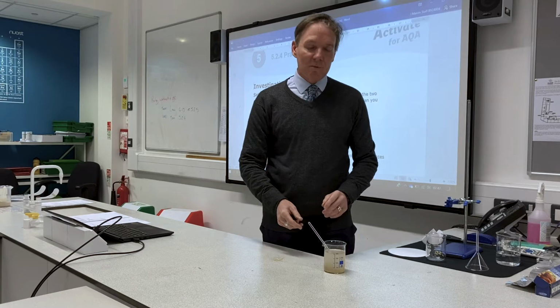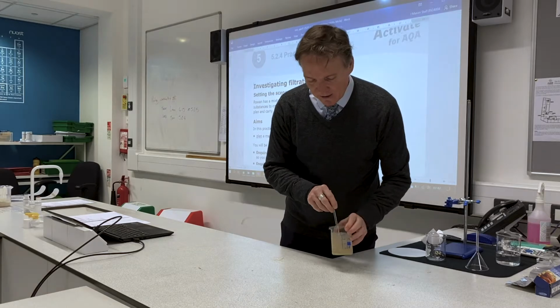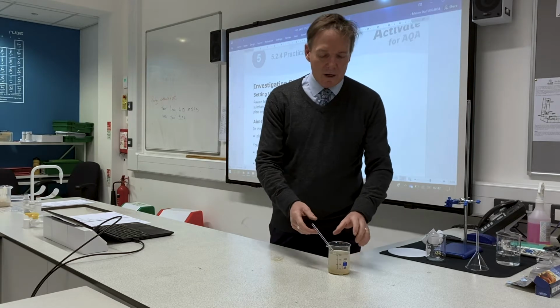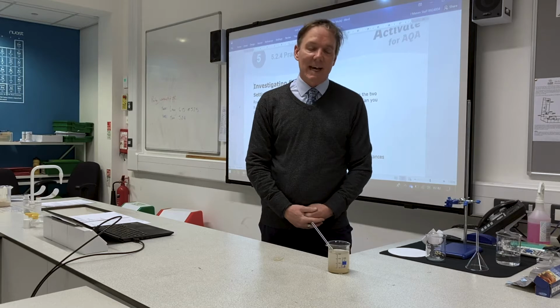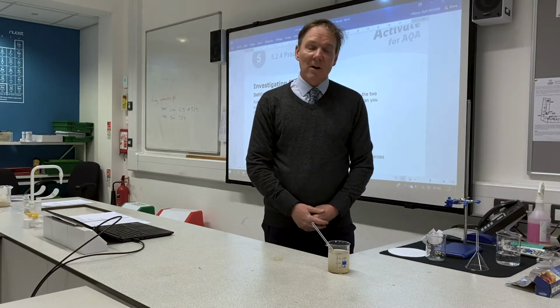We also have some salt in there, which you can see, although the solution looks a bit cloudy, the salt has dissolved. And this is the first part of a series of experiments where we want to try and get the salt out from this mixture of sand, salt and water. So the first part is filtration.